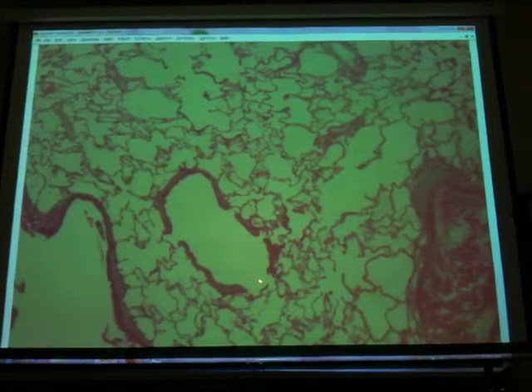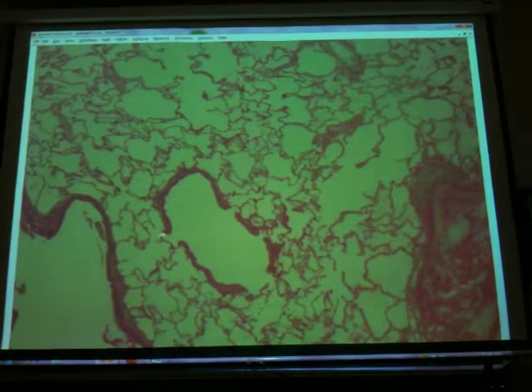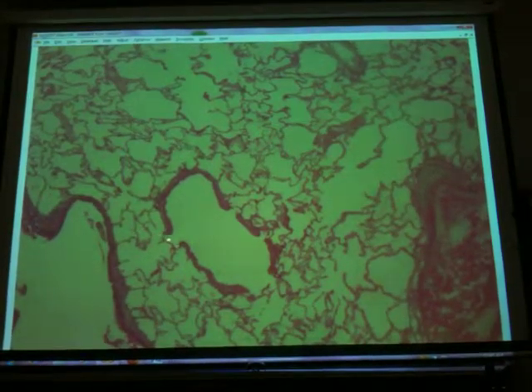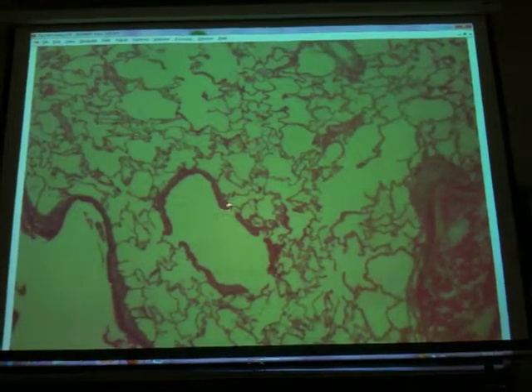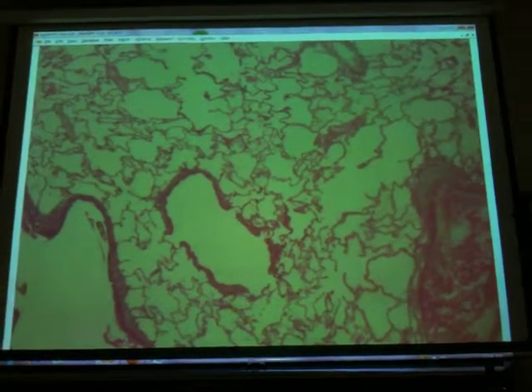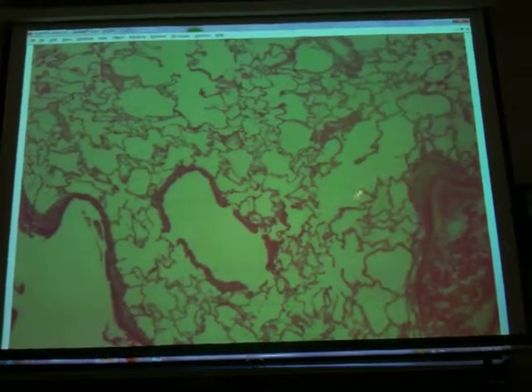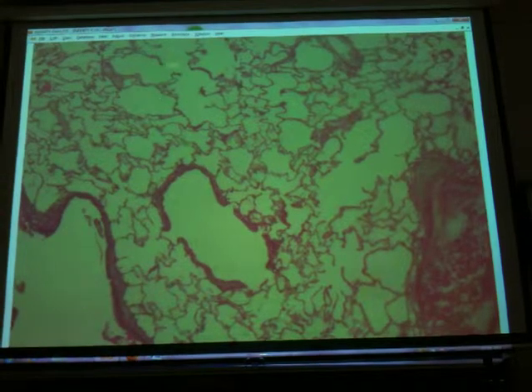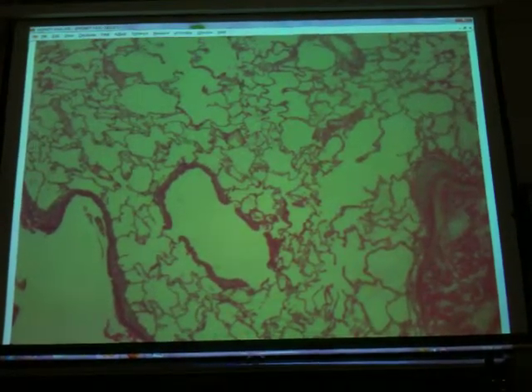This is one of those respiratory bronchioles, and you can see how it's come down to a simple squamous epithelium alveolus here. So this is the very end of a bronchial air passageway because we have little alveoli coming off of there. This is probably an alveolar duct, okay? And then this is an alveolar sac, just so that you see what we were talking about in lecture.